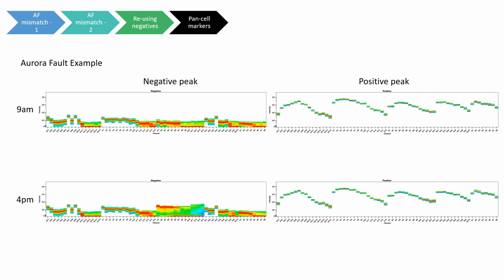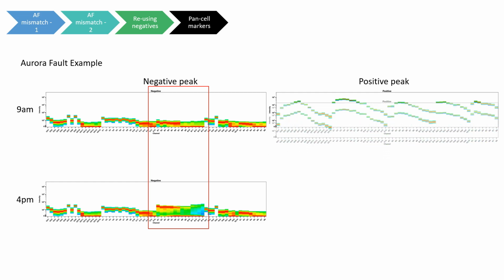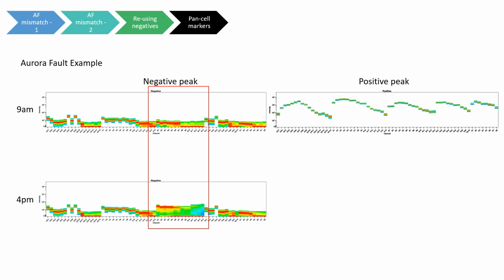As you can see, in the negative rainbow peak on the left, there is an increase in the low-end signal noise in the blue detectors. If we overlay the positive peaks on the right, there appears to be no problem. This, incidentally, is a flaw of most cytometer tracking or QC beads, because the symptom is often not visible in the brighter peaks.